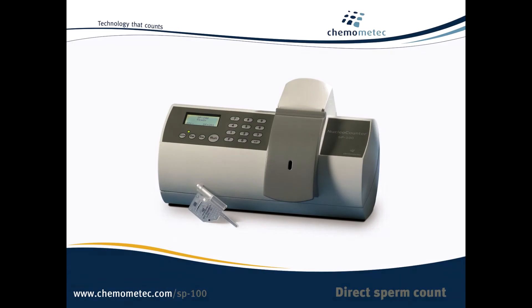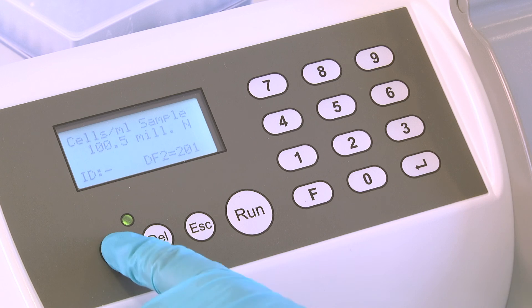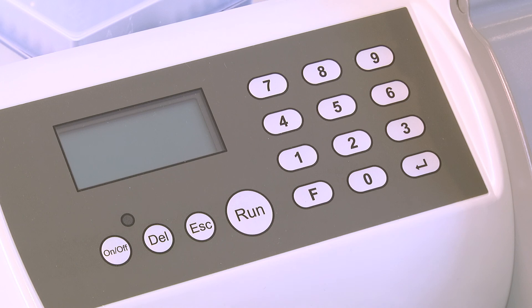To save the settings you have used, turn off the Nuclear Counter by pressing ON-OFF, then save the changes made by pressing ENTER. Otherwise, press ESC to cancel the changes made and the start-up settings are restored.